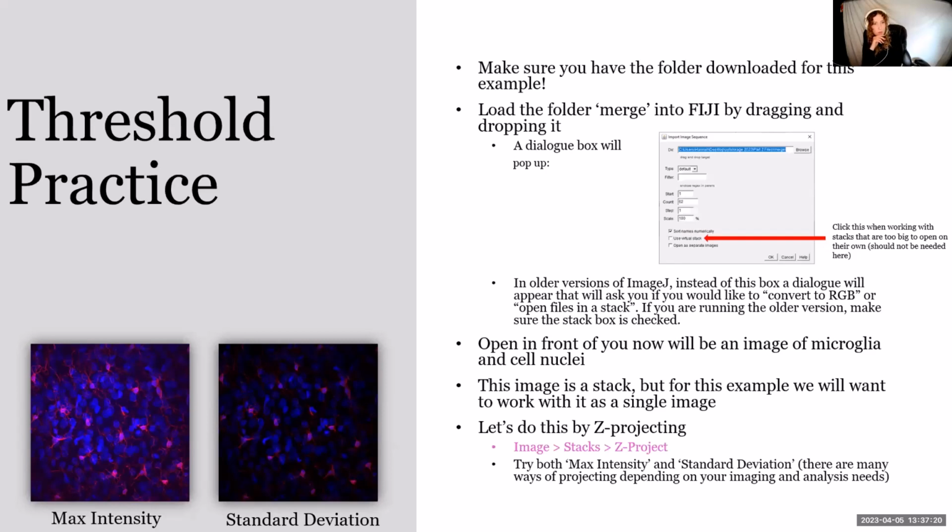So we're having some problems dragging the whole merge folder. The people who are doing that, are you doing it on your laptops, or are you on an older computer or a newer computer? What are your parameters? Is it possible for them to do Import Image Sequence instead, maybe from file, instead of just dragging it? Would that work? You can definitely try that.